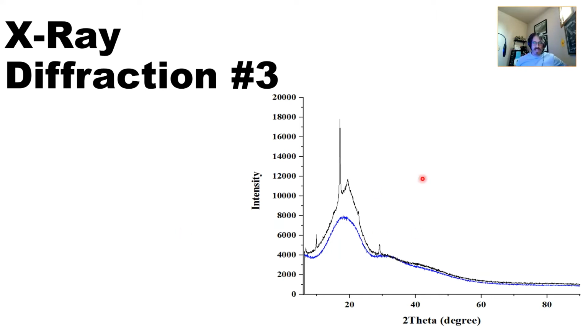And here's an example of some recent work that we're actually doing in the lab. This is actually a polymer spectra, and polymeric materials do indeed exhibit a flavor of crystallinity. We're going to be talking about crystallinity and crystal structure and how that interacts with X-ray diffraction for this lecture. So I thought a spectra like this was quite appropriate to start the lecture off.